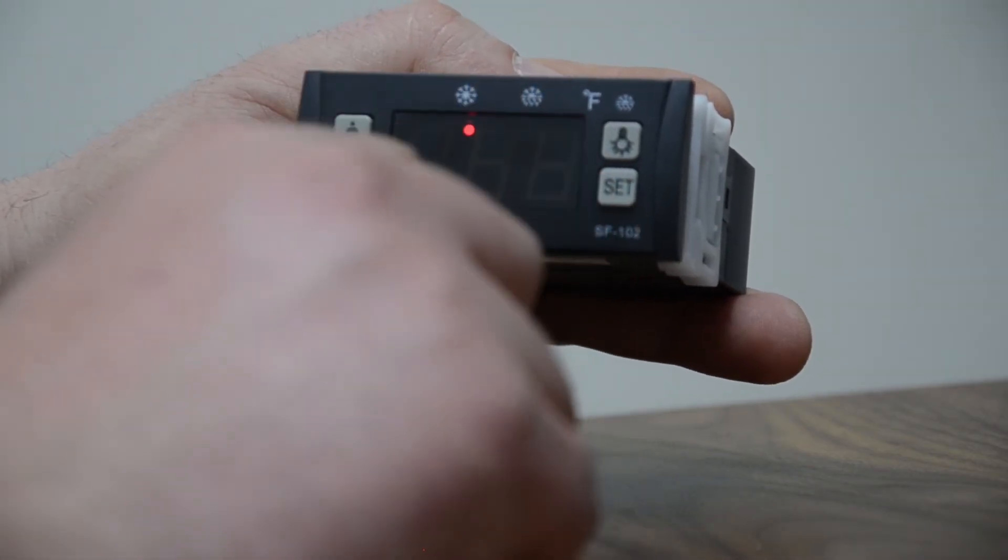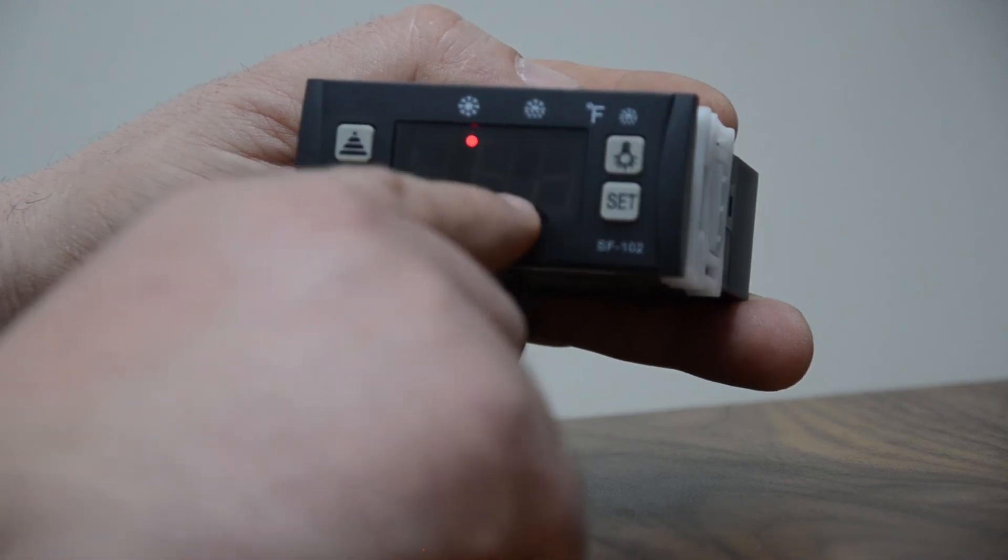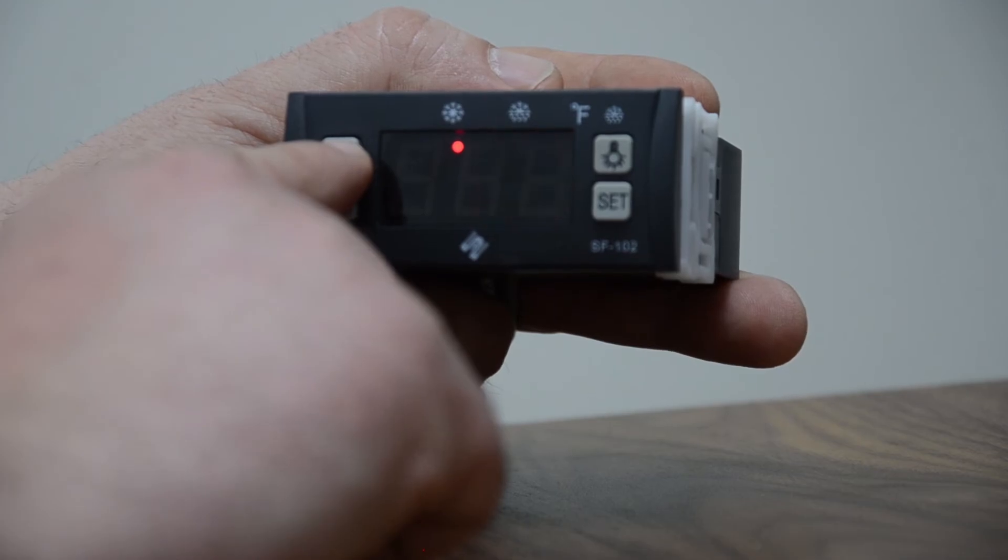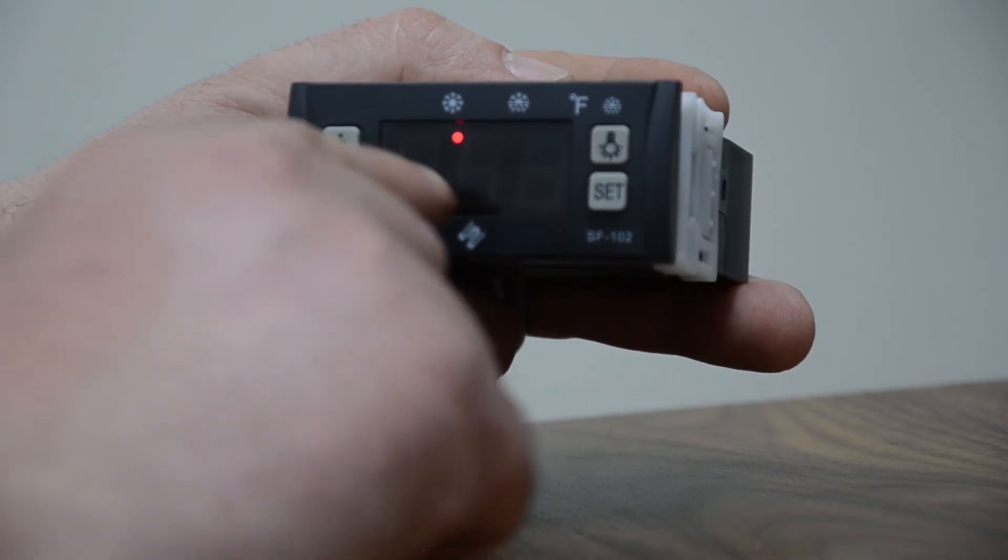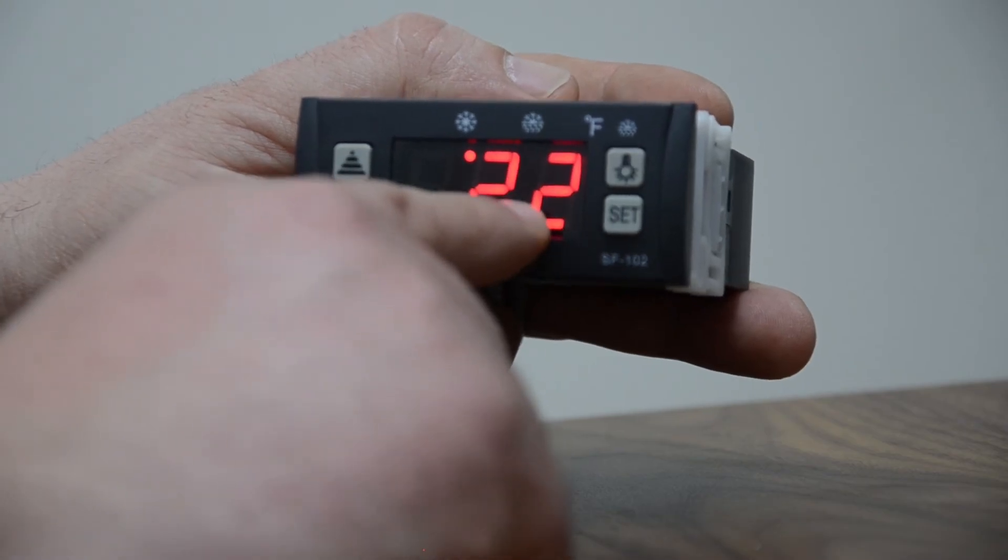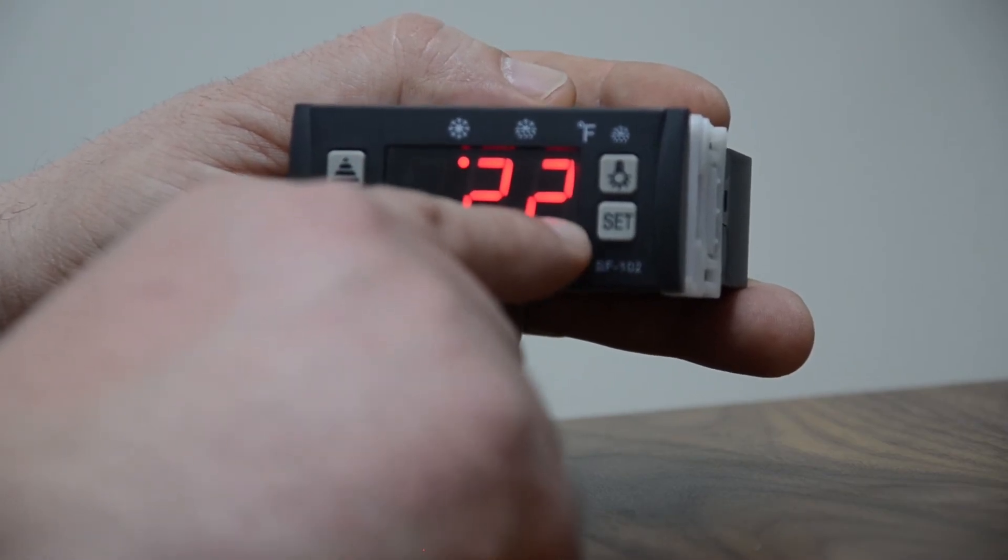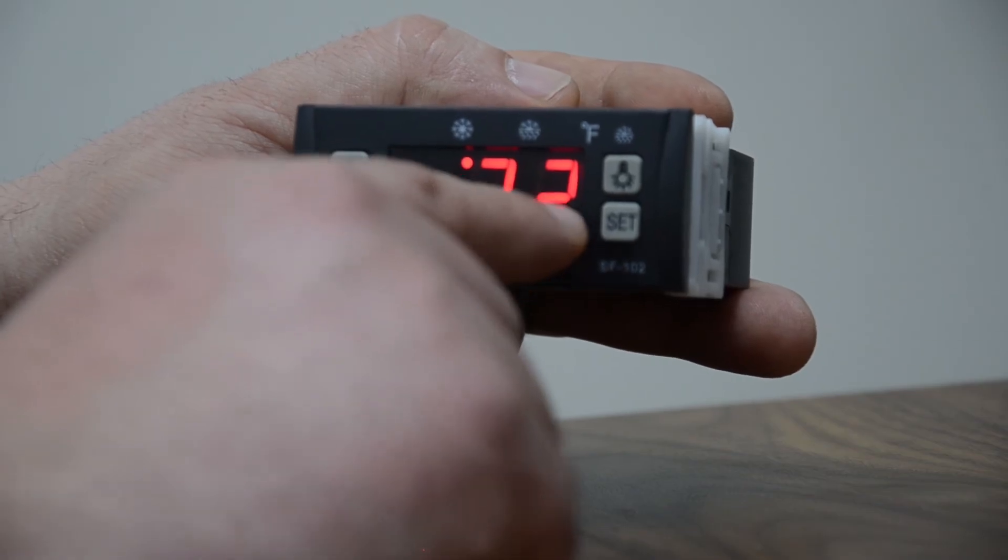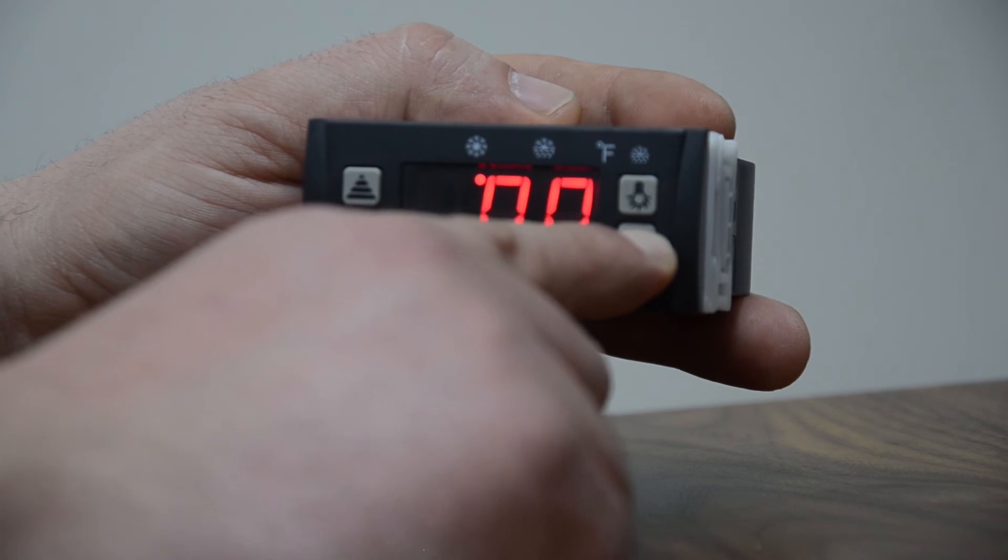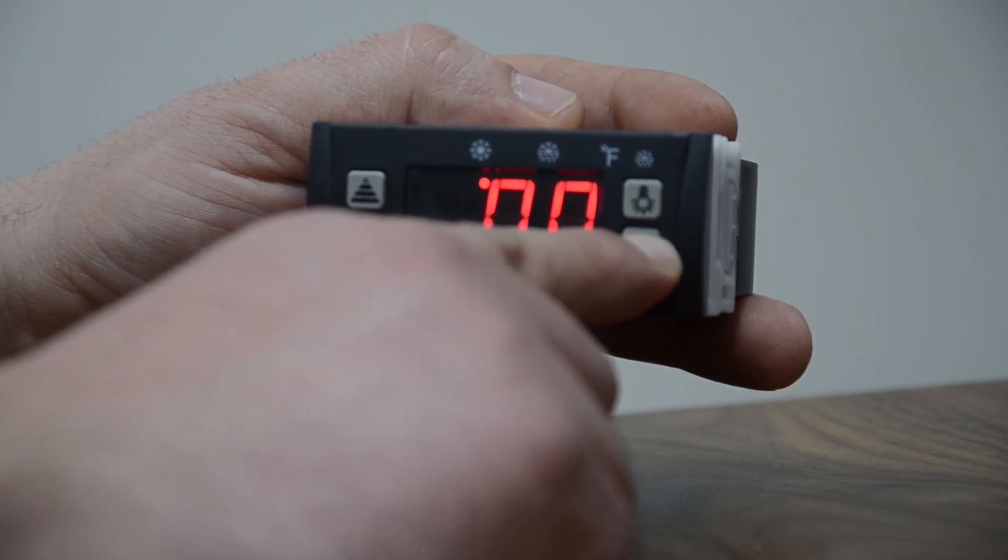F3 is defrost termination temp and we usually keep it at 12. The reason why we do that is because it's either going to do 20 minutes to 25 minutes and defrost, or if it reaches 12 degrees first, it will stop the defrost and kick back on because you don't want the products inside to get too warm. F3, we want at 12 degrees.